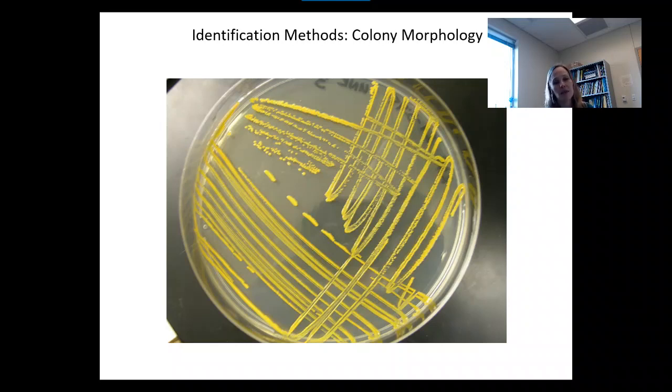So what's happened here is the bacteria have been spread evenly across the plate to the point that individual bacterial cells have separated from each other, and then those bacteria start copying themselves. They copy themselves tens of thousands, even hundreds of thousands of times, to the point that you can actually see them without a microscope. So these piles, these circles, represent what is called a colony, and that is a pile of identical bacteria that have just copied themselves so many times that you can see them.